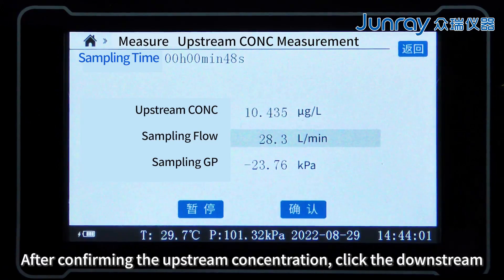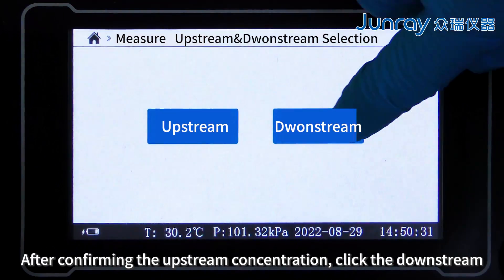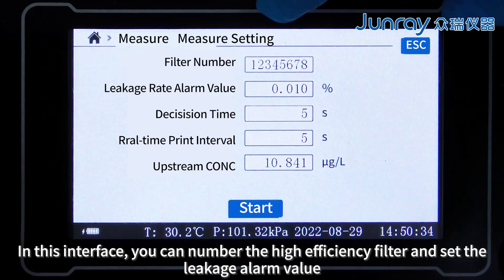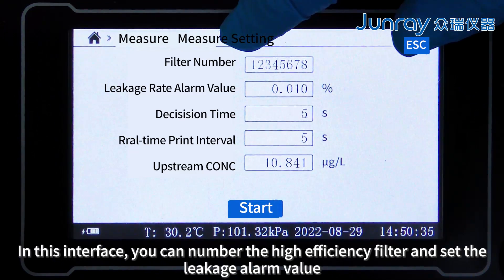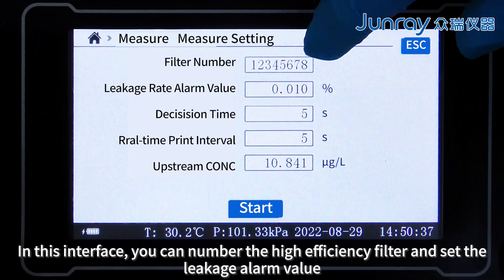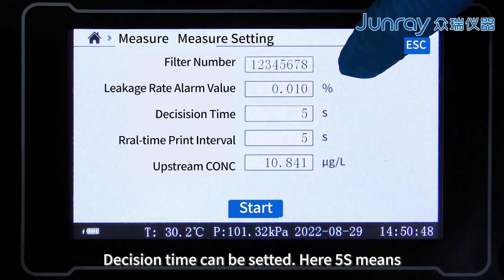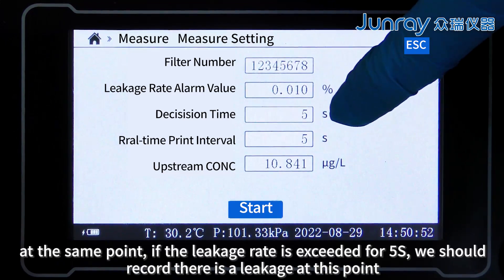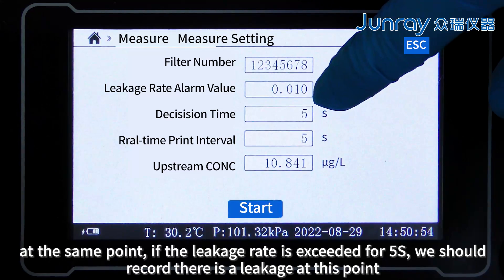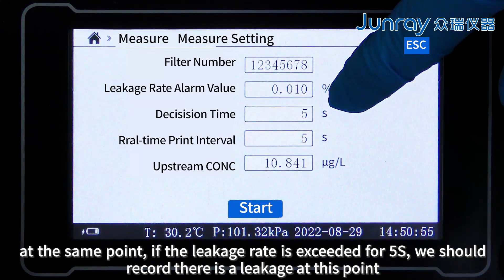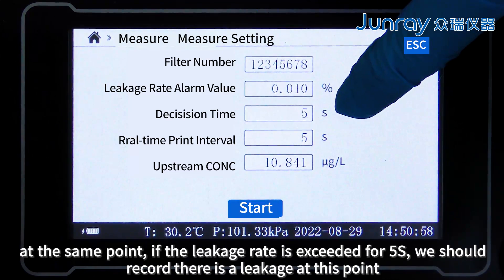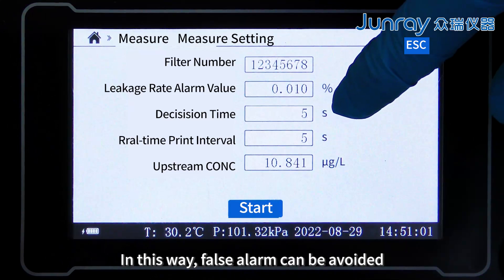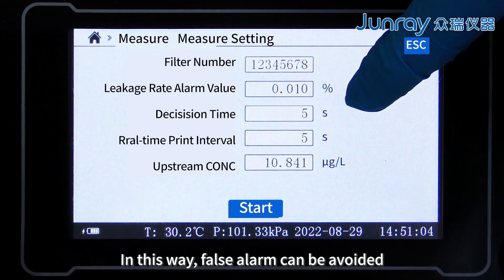After confirming the upstream concentration, click downstream. In this interface, you can number the high efficiency filter. Click the filter and set the leakage alarm value. Decision time can also be set — 5 seconds means that if the leakage rate is exceeded for 5 seconds at the same point, we record that there is a leakage at that point. In this way, false alarms can be avoided.